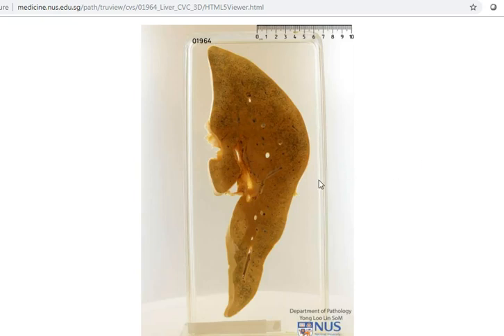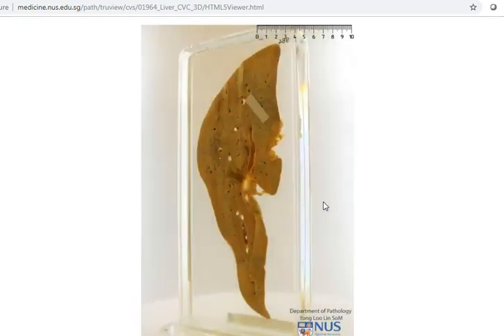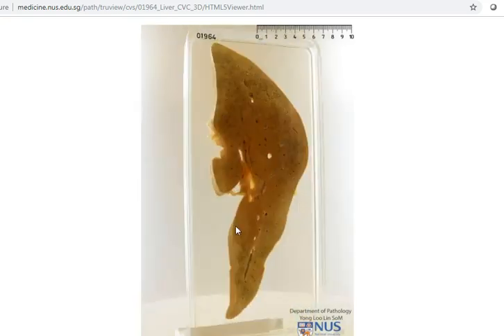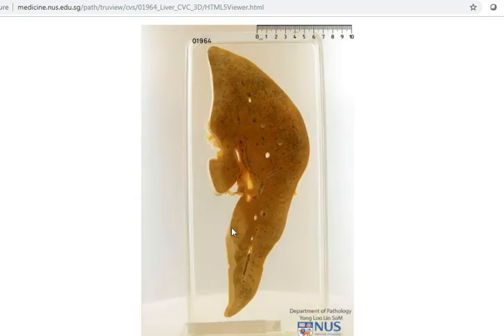This is a specimen of a liver, and it is a slice. What we're looking at is a pathology that is diffuse, meaning that it evenly affects the whole of the liver. This is in contrast to a discrete lesion such as a mass or a cavity, which would only affect one localized area.